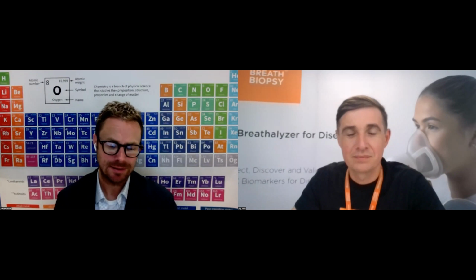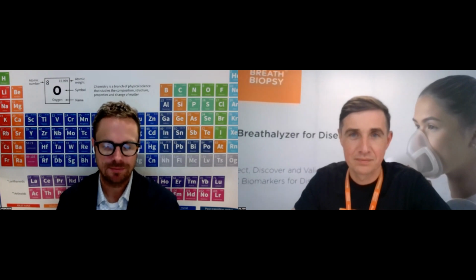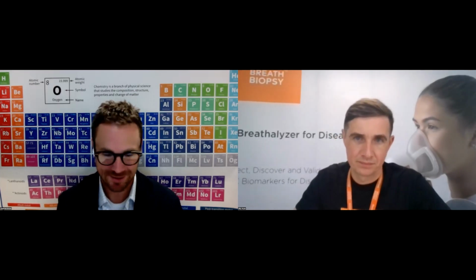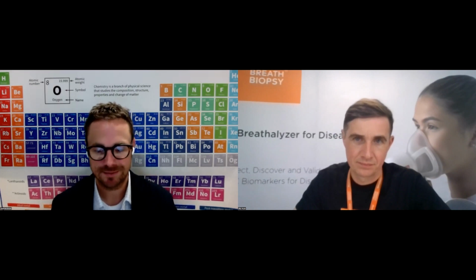Yep. So we have generally gone with the more relaxed approach. For a lot of the discovery work we do, I don't have a high N most frequently, and so I've got to get the most options to go forward with validation, and then that justifies those additional studies to then be able to do more targeted analysis and eliminate things. Essentially, we would rather have a wide breadth at the beginning and then narrow it down, as you said, when we do a validation type of analysis.